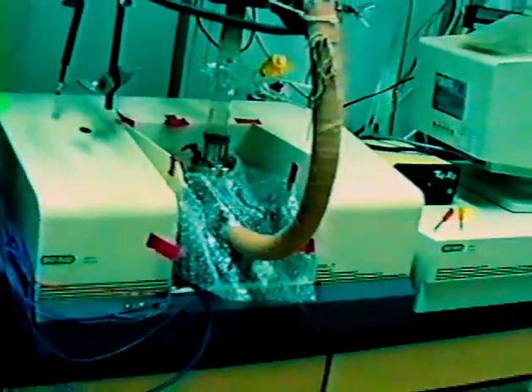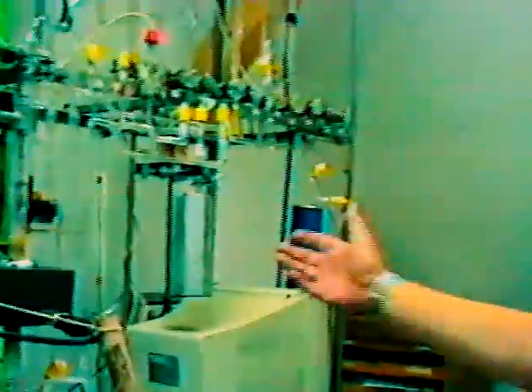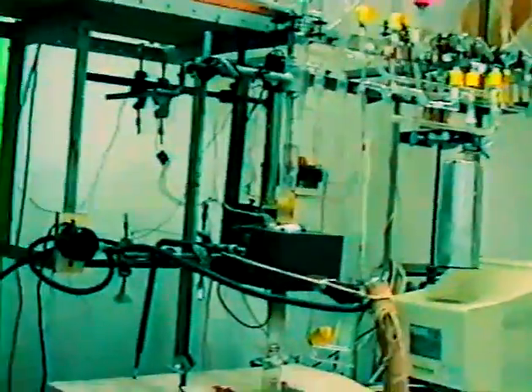So to a very low adsorption temperature, and we can investigate the adsorption processes from this temperature up to room temperature. If we want to investigate what happens at higher temperature, we can move our sample from the bottom to the middle part of the cell with the help of this magnet. Okay, this is a BioRad. As far as I know, this is a US-made Fourier transform. It's well-known. And a very traditional vacuum and gas handling system belongs to the infrared cell.